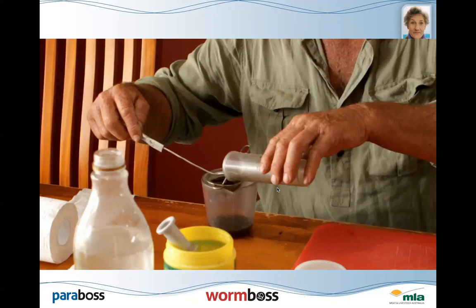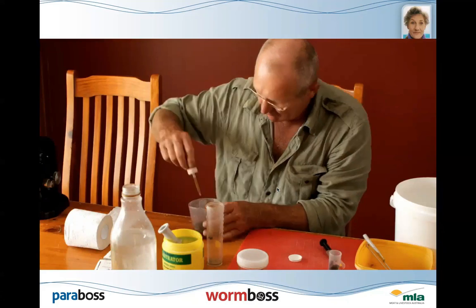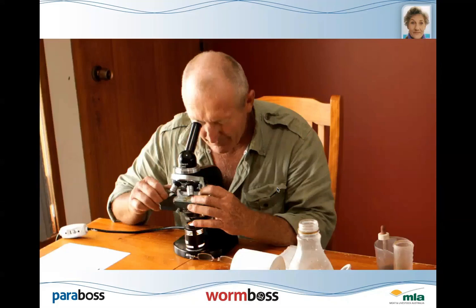He puts it through a sieve, and that gets rid of a lot of the materials that are in the feces that clog it all up a bit. Then he takes a bit of the sample out. He puts that into a special slide.